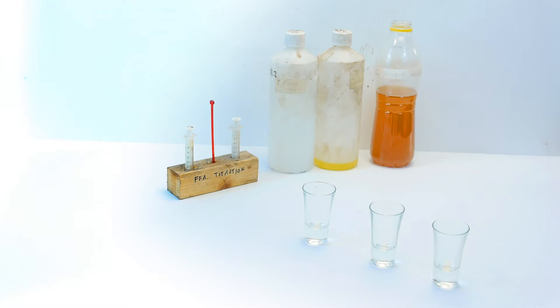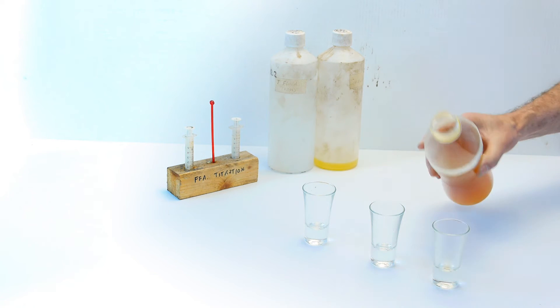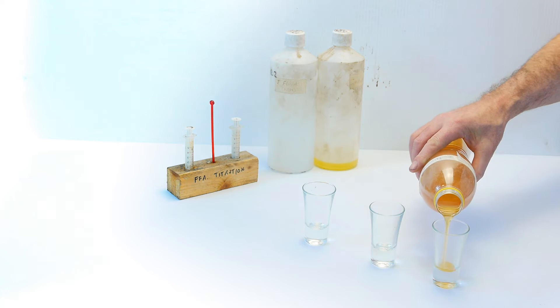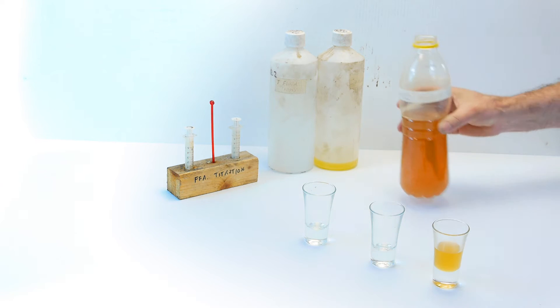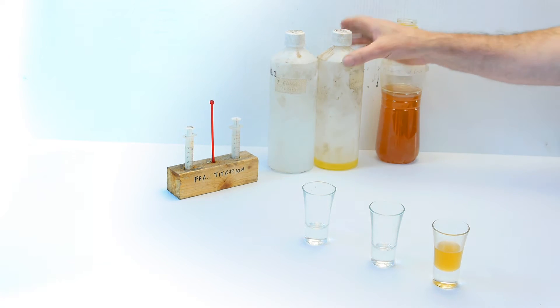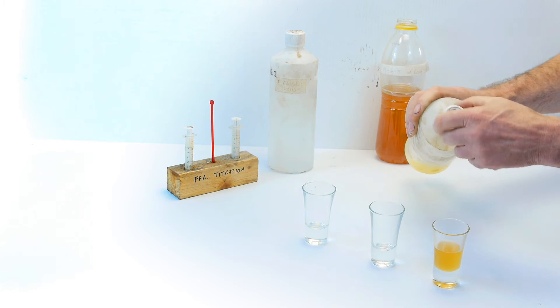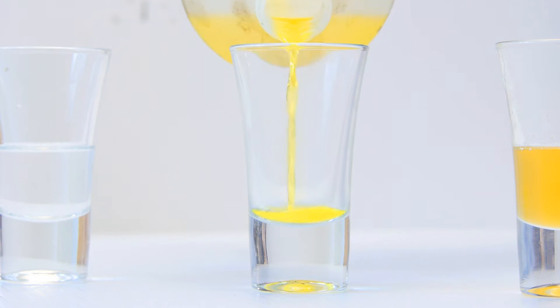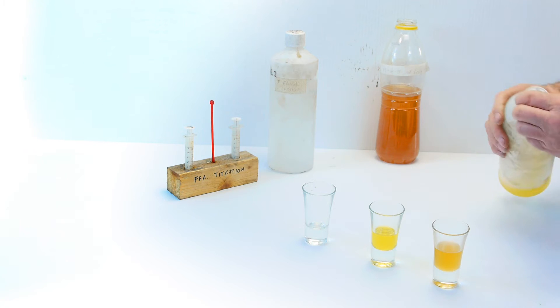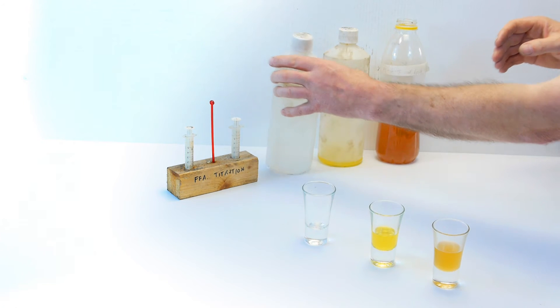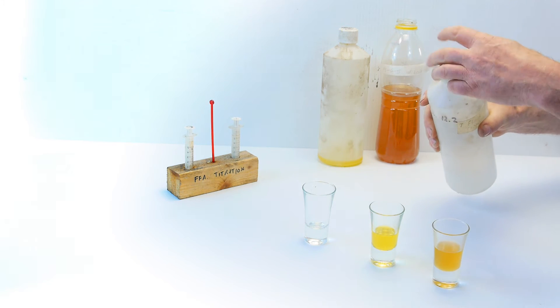To perform the titration, first lay out your glasses in the order you see them there. Fill the first one with vegetable oil that you want to test. The second one, about half fill the small glass with the yellow indicating fluid. Next, fill up the third glass with clear titration fluid.